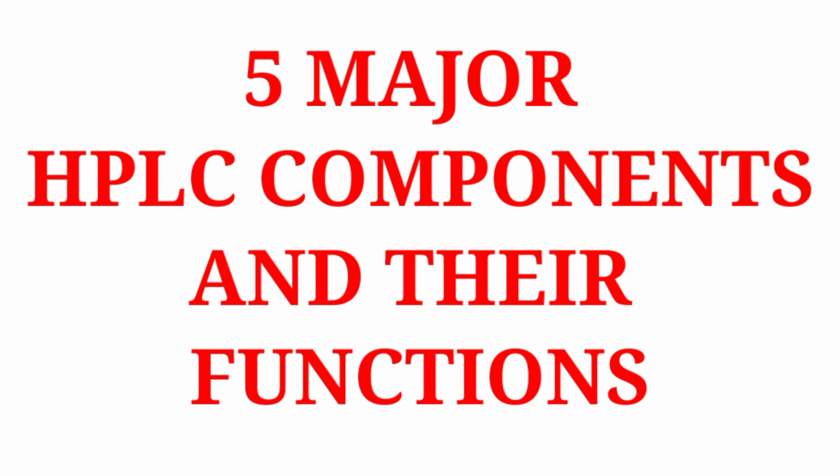Friends, in today's video, I am going to discuss 5 major HPLC components and their functions. So let's begin the video.